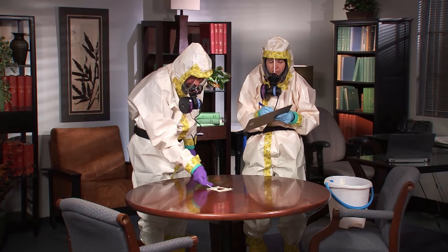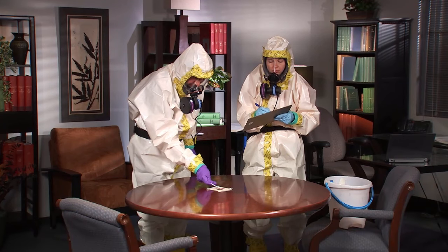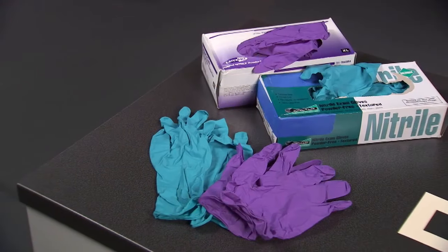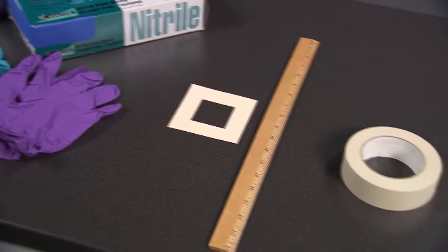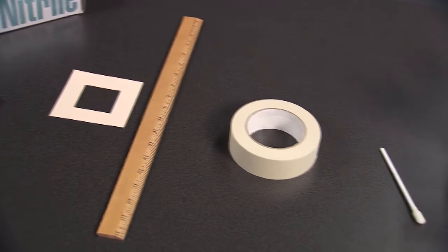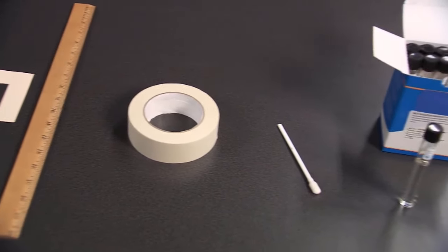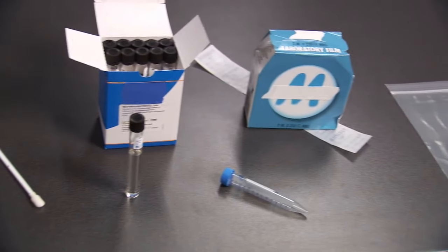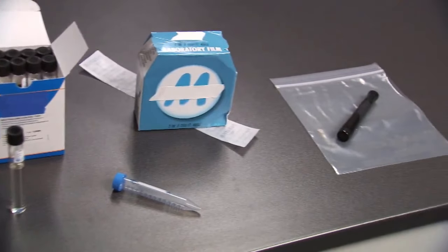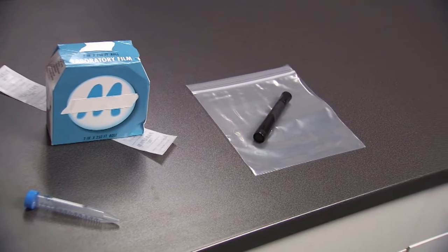Before sampling with a macrofoam swab, the sampler and the assistant will each need a pair of new gloves, a 2 inch by 2 inch disposable template or a disposable ruler, tape, a macrofoam swab, buffer solution, a screw cap tube, paraffin film, a resealable plastic bag, and a permanent marker.